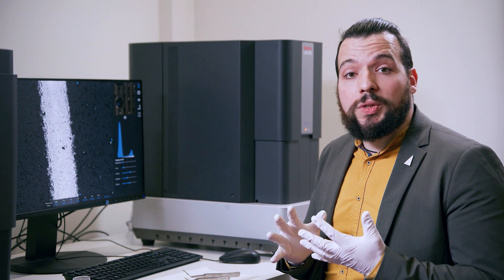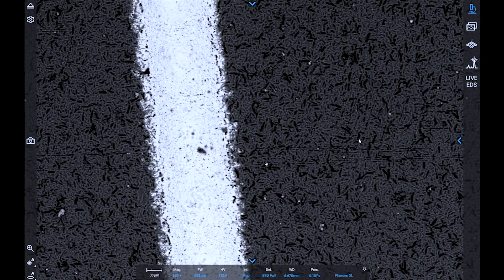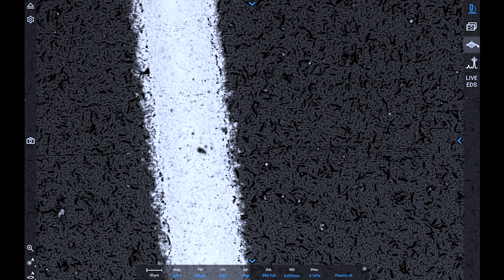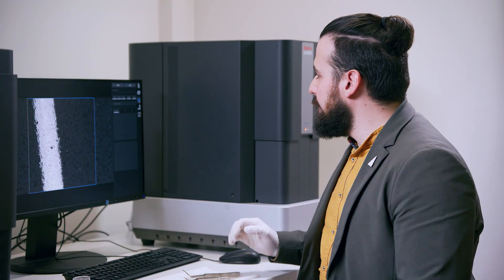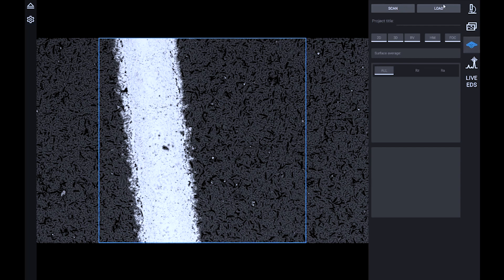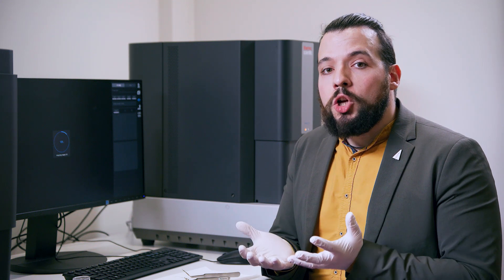Additional information on the sample can be achieved by using the ProSuite. 3D roughness reconstruction can be used to create a scan of the sample and check the roughness of the surface. With one button, we can instruct the tool to use different quadrants of the backscatter detector to create shadows on the sample surface.